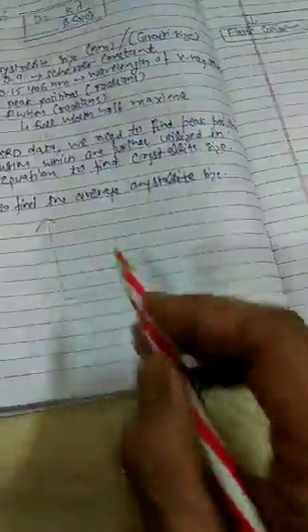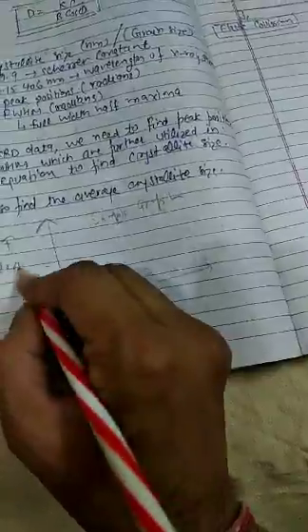How we are calculating this, let's suppose this is the sample graph from an XRD that we obtained. Obviously it is in between intensity and 2 theta. Let's suppose we are getting a particular curve like this and so on. These are the peaks.